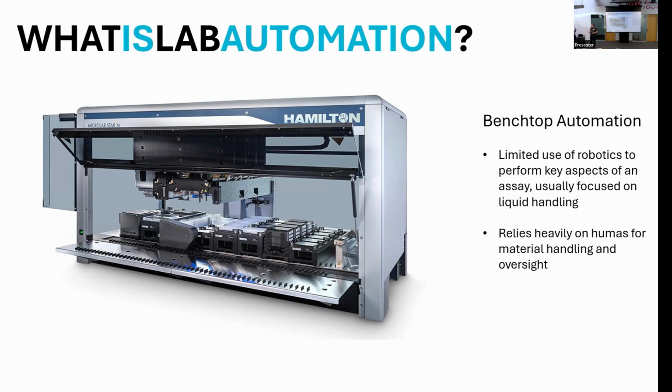So traditionally the first step is this benchtop level automation. It's still focused on people moving samples around, but gives you the opportunity to gain a little bit of additional walk-away time, to have the liquid handling managed by a robotic system rather than a scientist.